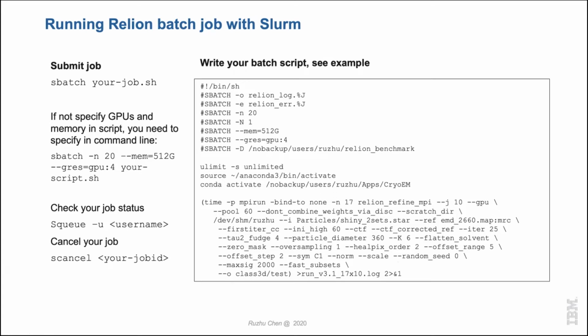These two give you better performance, but may not get you the good results you want. But if you have a lot of data to process, I think these two parameters are good to set to run faster.